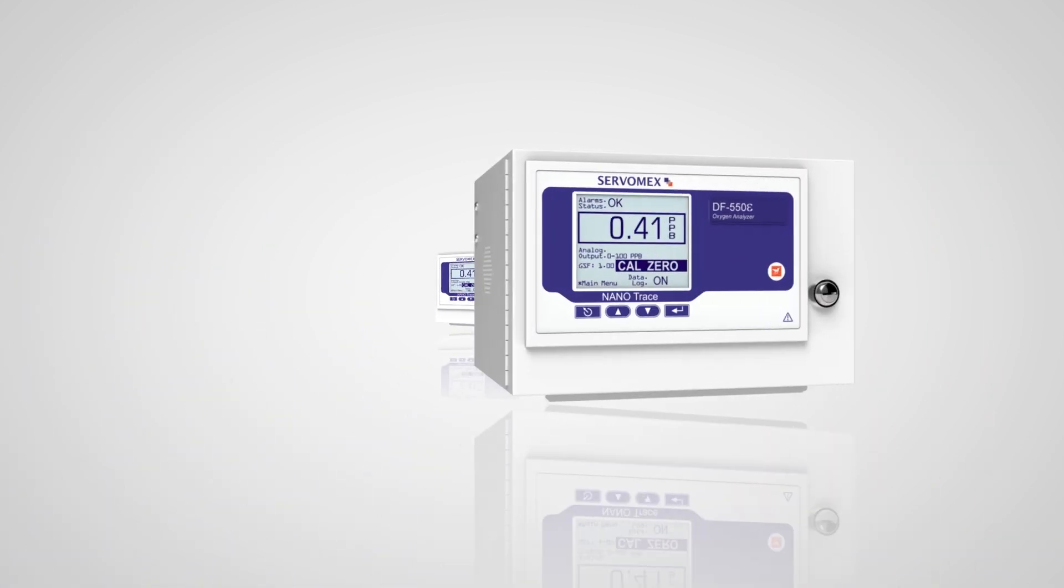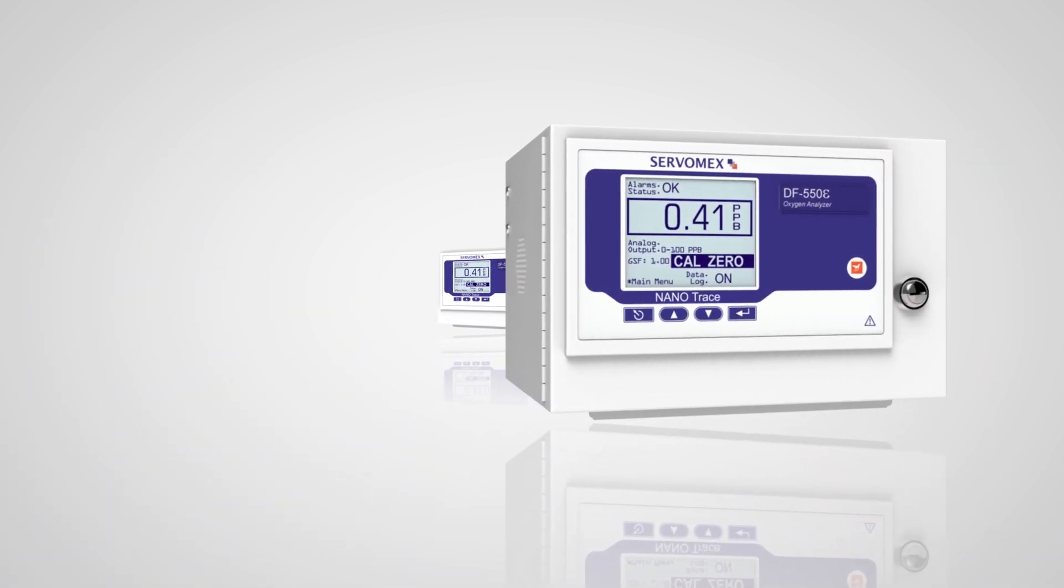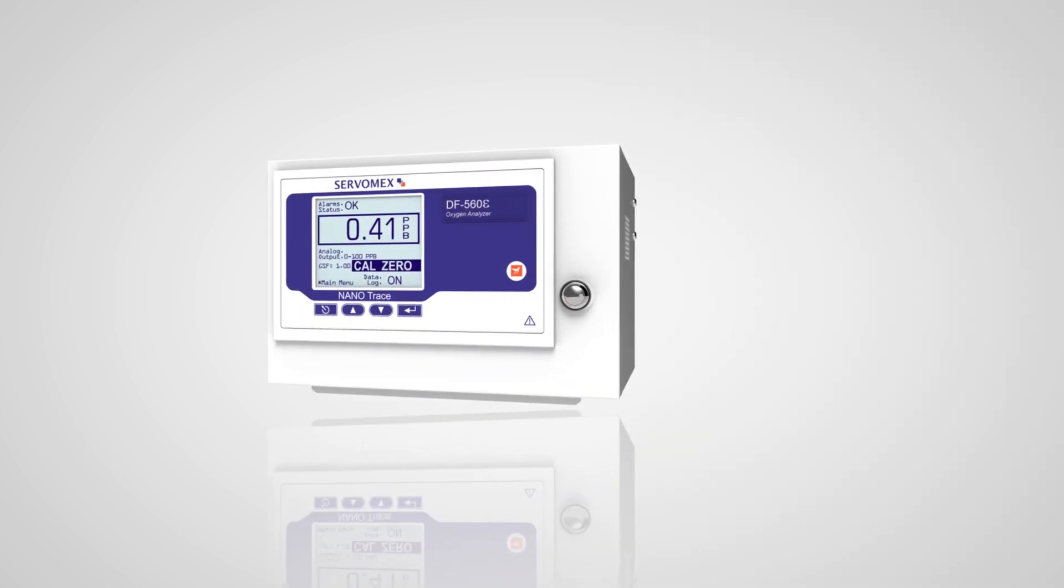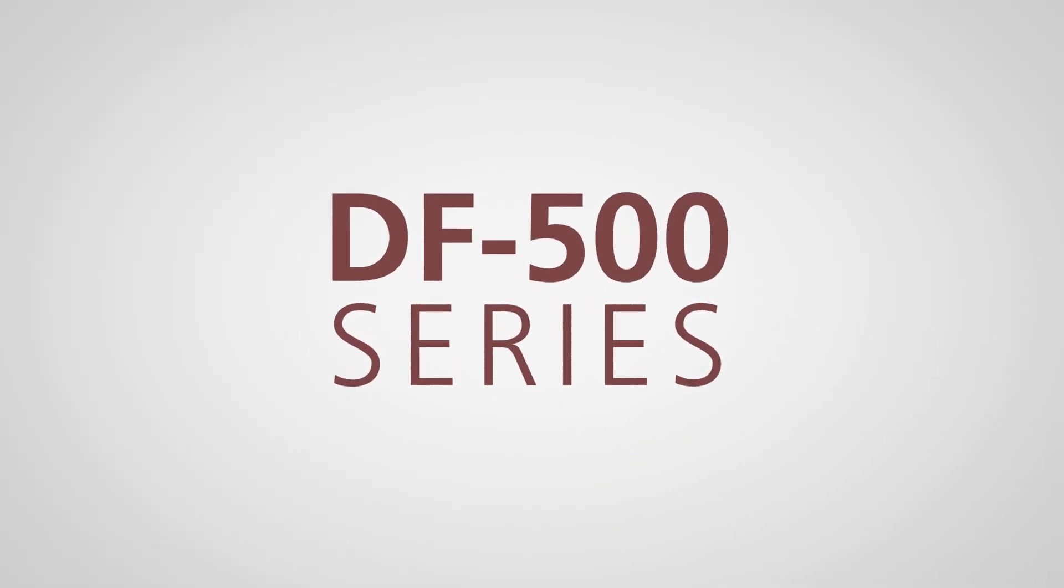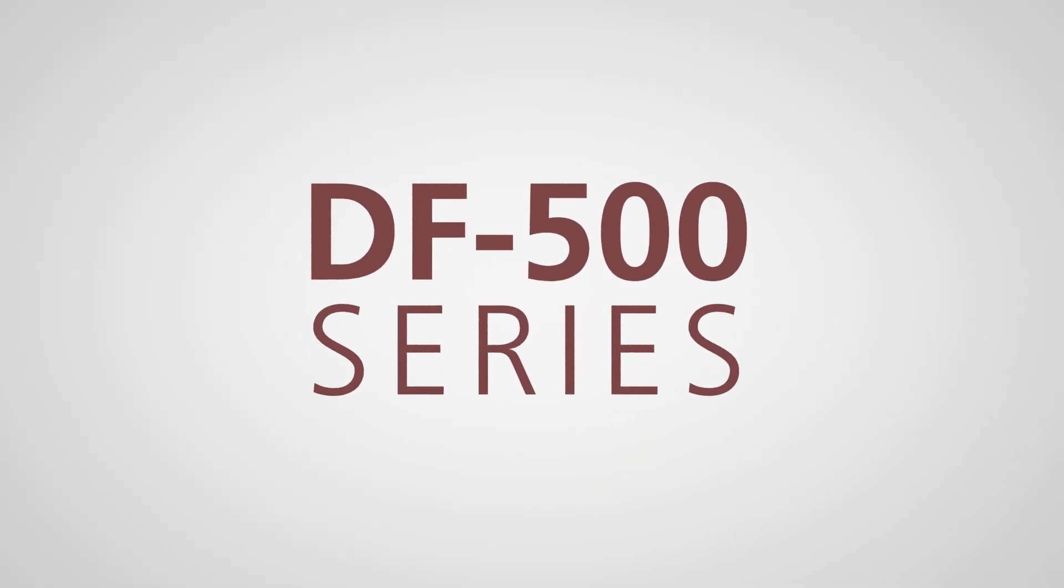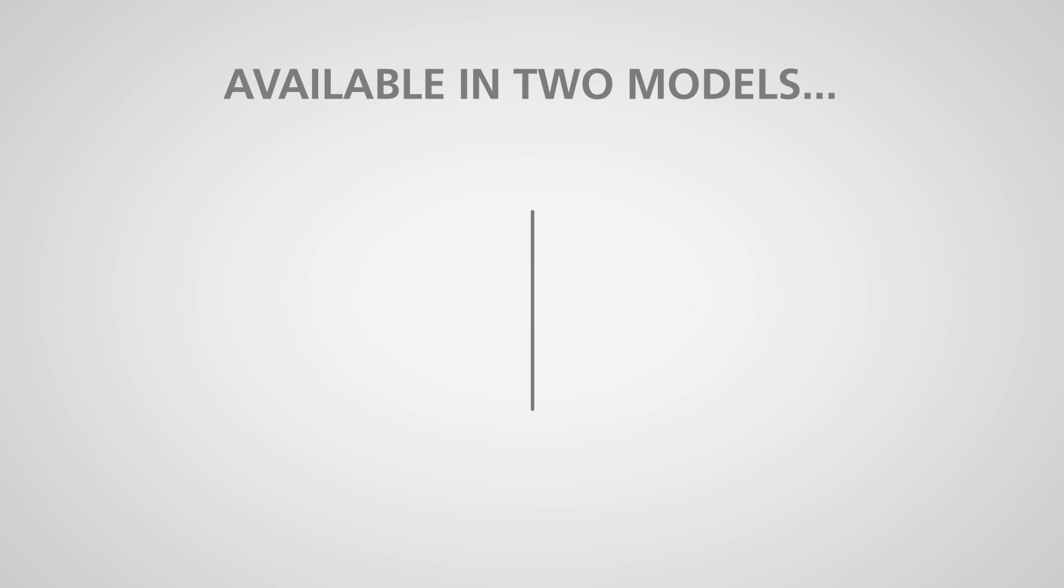The analyzers of choice for the semiconductor and specialty gas industry, the DF500 is available in two models.